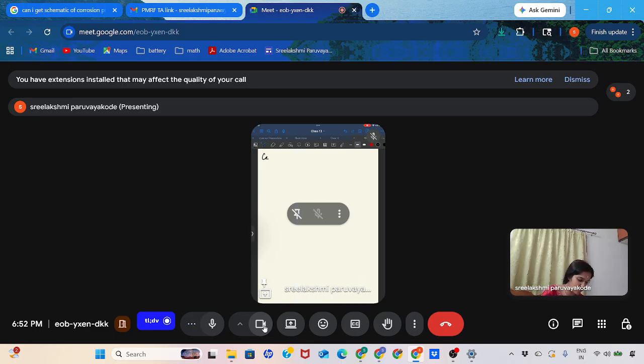So the next one is cation vacancy generation. There is a movement of the cations from the film into the electrolyte at the film electrolyte interface, the solution surface, and this is resulting in the formation of a cation vacancy in the film. When it goes to solution, obviously there's a vacancy. The cations in the film can either oxidize further, which means it goes from this state to that where it's in the solution state when it moves into the solution.